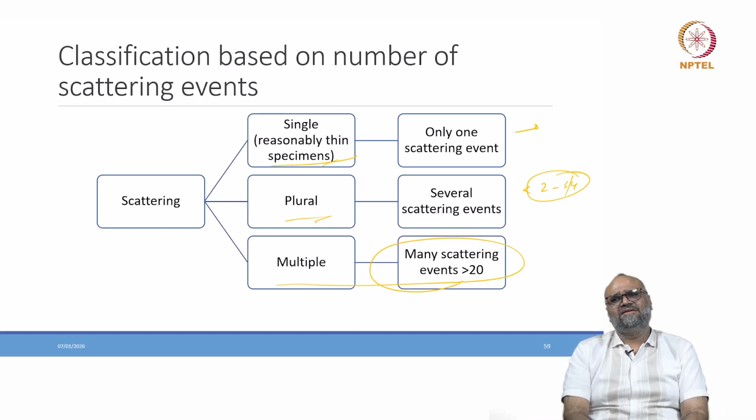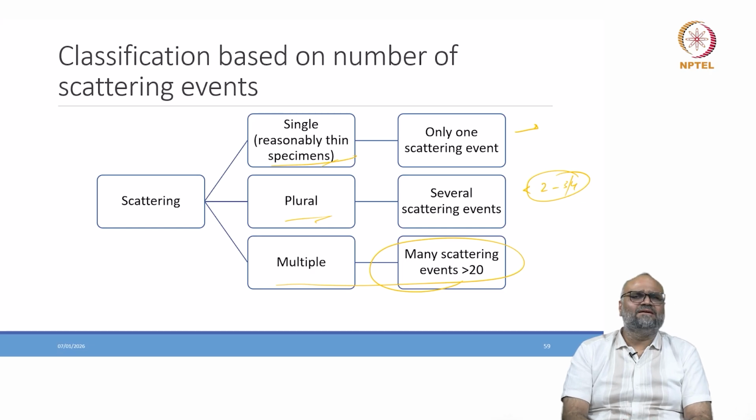And this forms the foundation of understanding of a few principles called scattering cross section or probability of scattering, and this forms the foundation of electron matter interaction for a transmission electron microscope, or for electron microscopy in general.